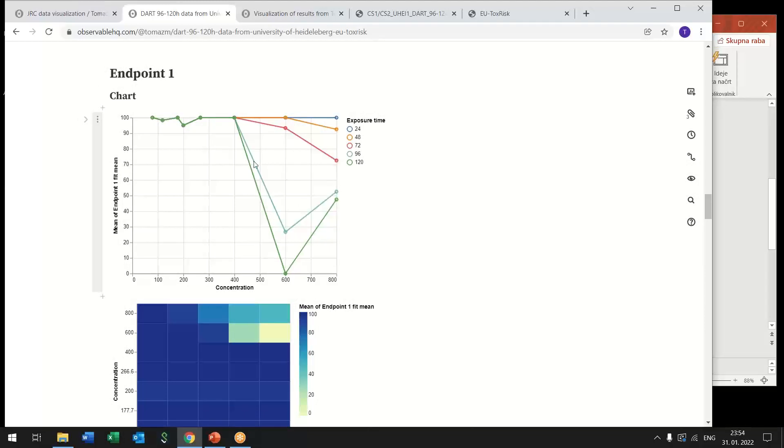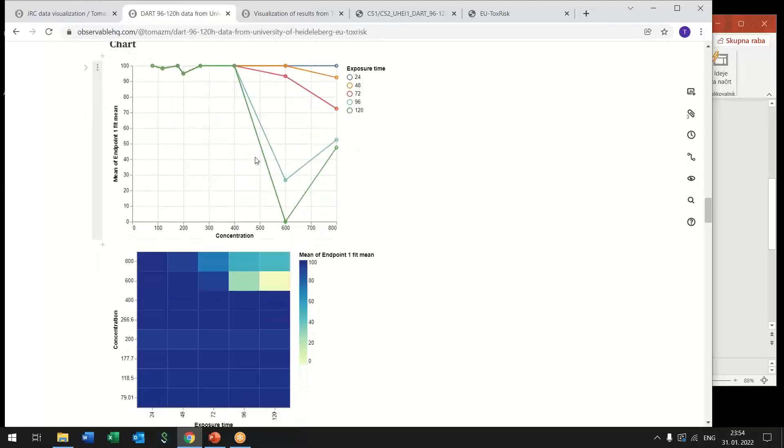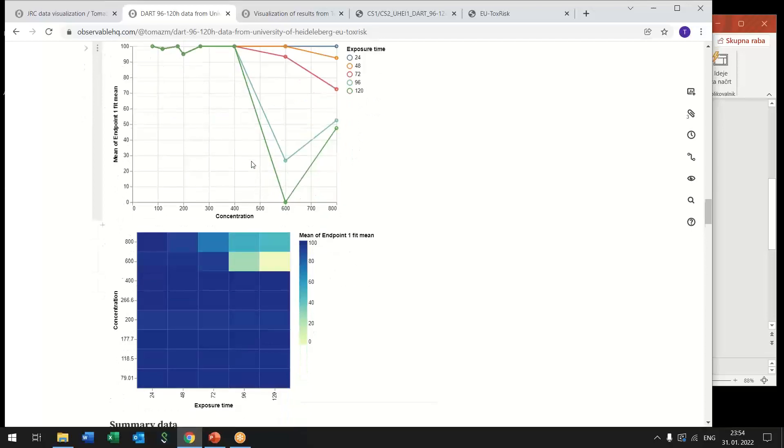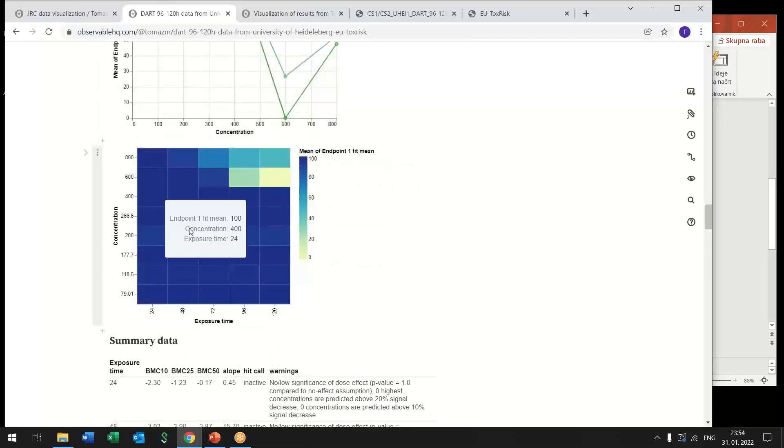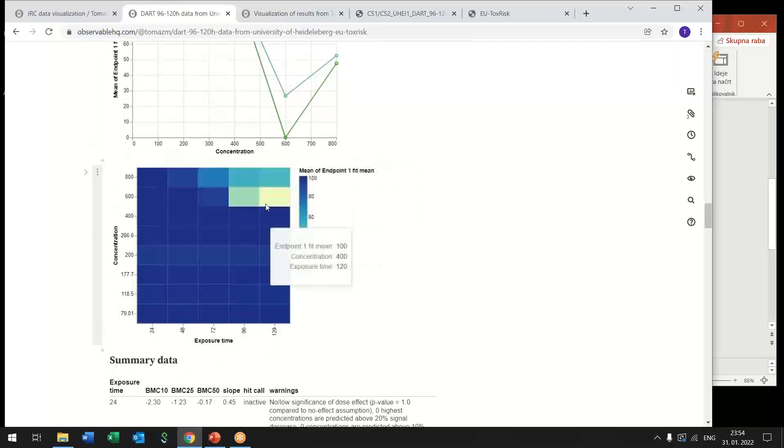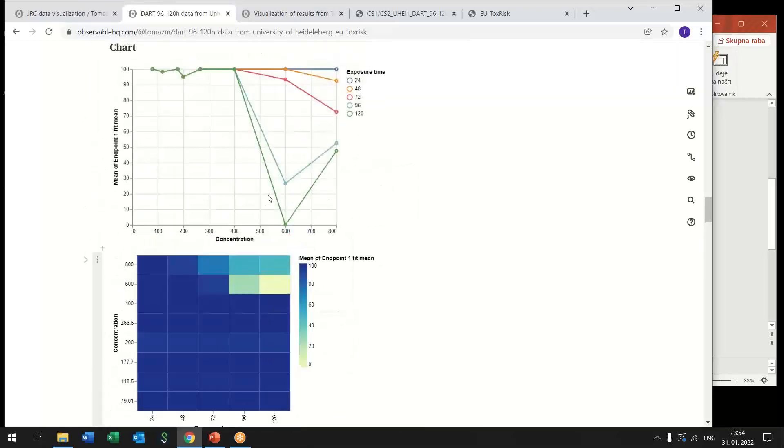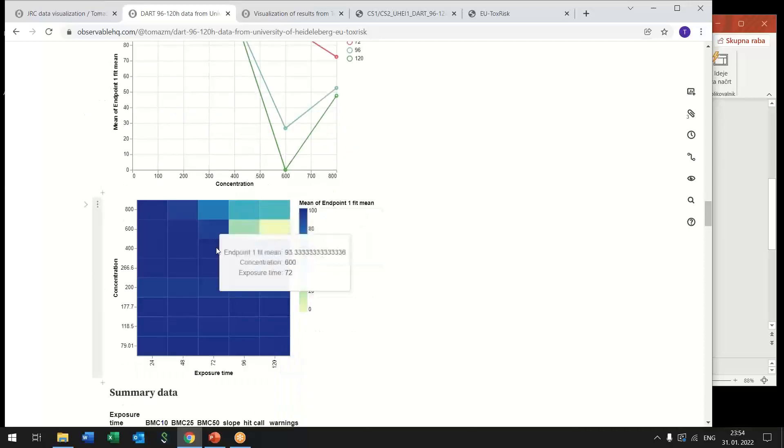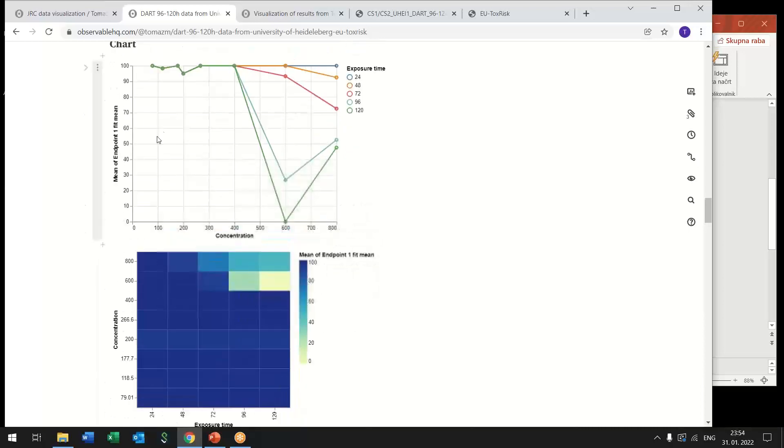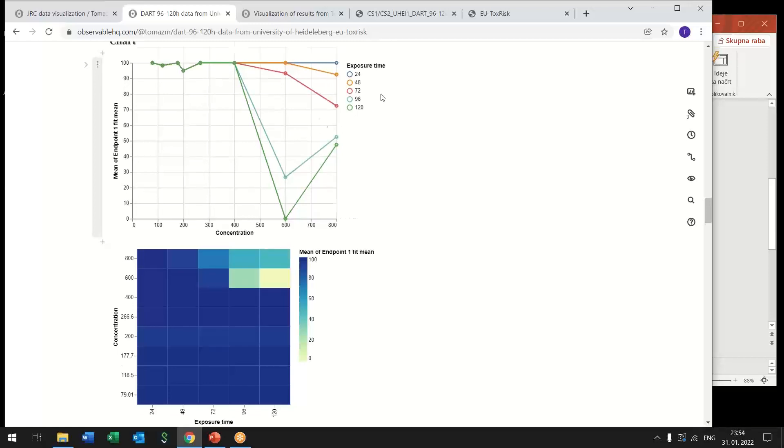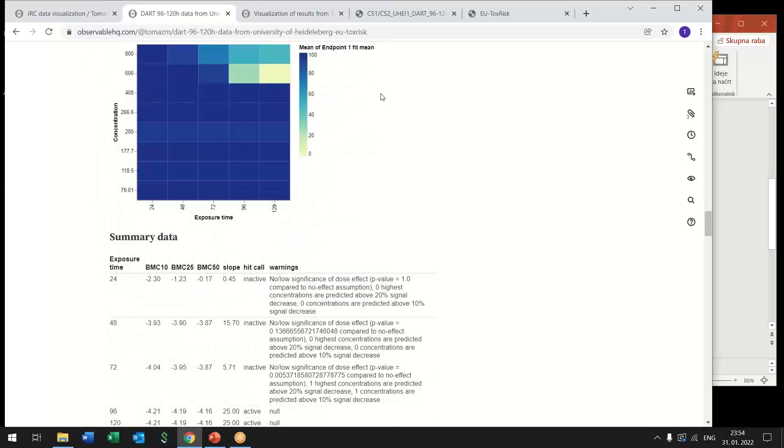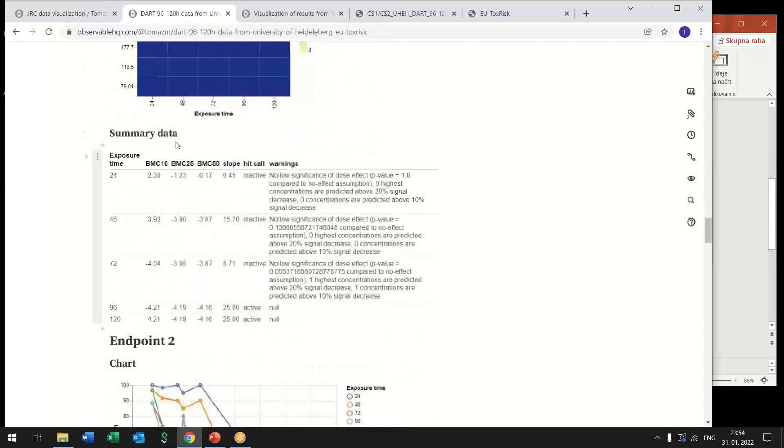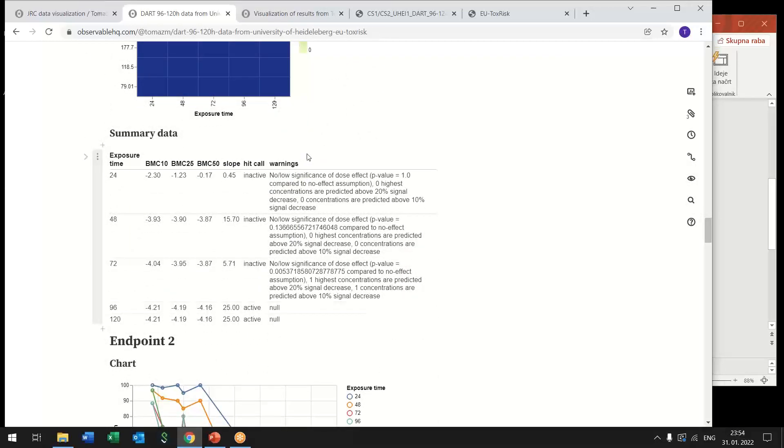Again as in the JRC case we can look at the concentration versus time profile as a heat map or as a line chart where we have endpoint versus concentration and each line corresponds to a single exposure time.